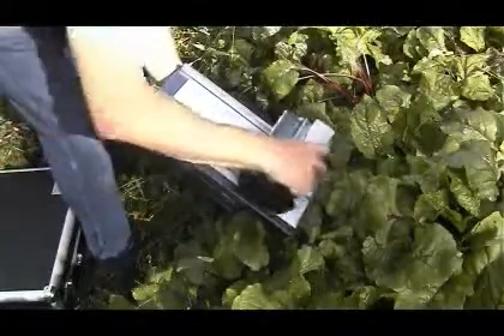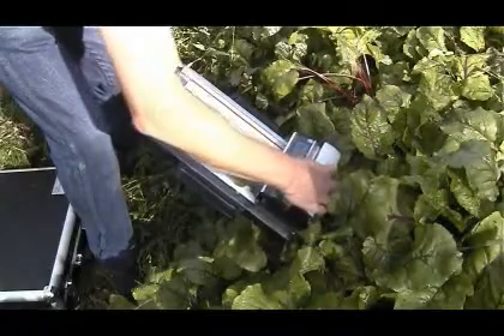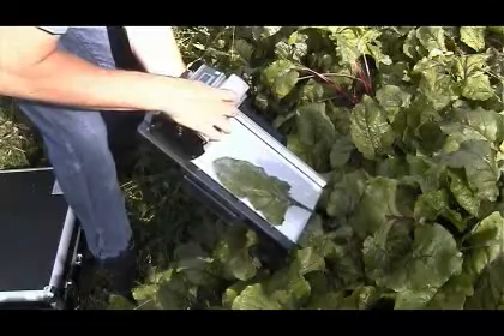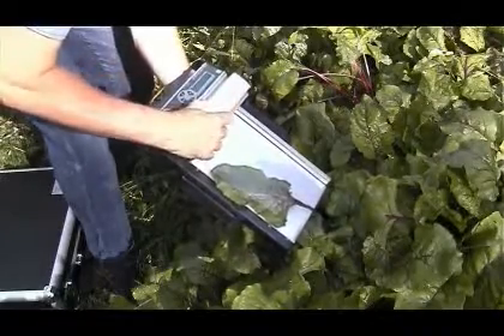Users can perform non-destructive measurements on leaves of living plants by simply sliding the scanner over the leaf, enabling the collection of data from the same plant or even the same leaf throughout its lifespan.